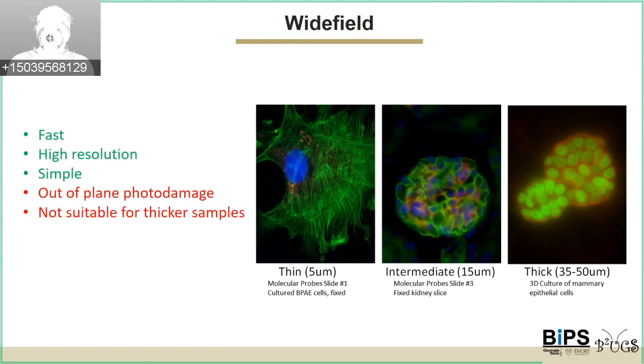So overall, widefield is useful because it's fast, you can obtain high resolution, and it's as simple as it gets in terms of a setup. The downsides are it won't work well for thicker samples, and there's a large amount of photo damage away from the focal plane.